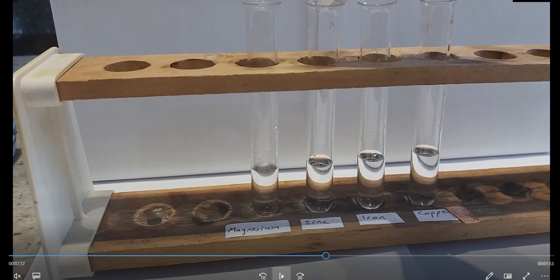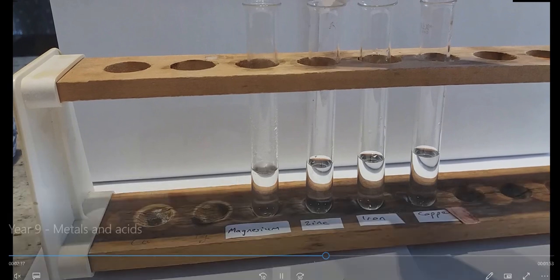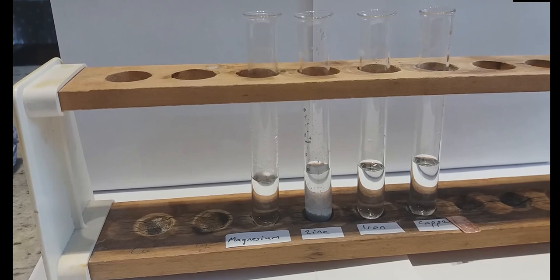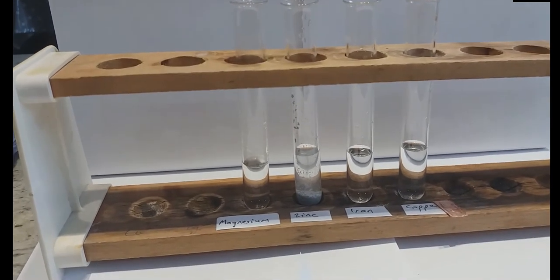So there's a moment or two after the reaction finished. Look, the magnesium's all gone. Alright, so that's it, completely reacted. Now we'll show you zinc and iron. So here's some zinc going in. We've dropped in the powder. And again, when we get in a little bit closer and it gets focused.